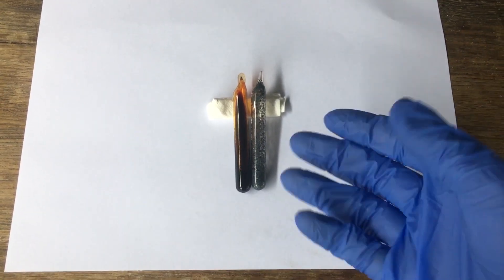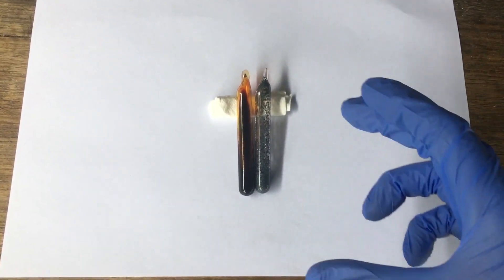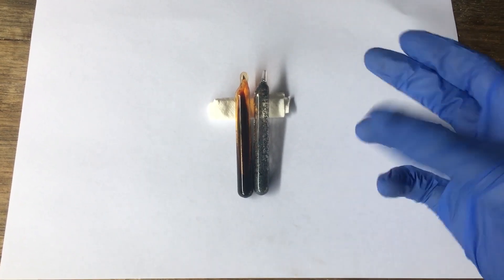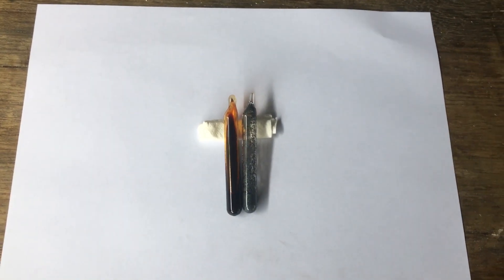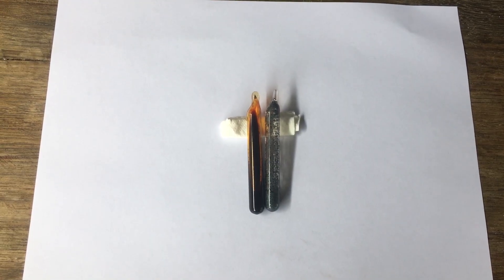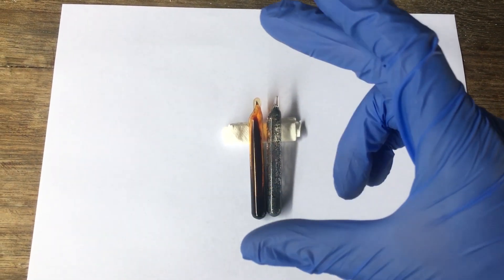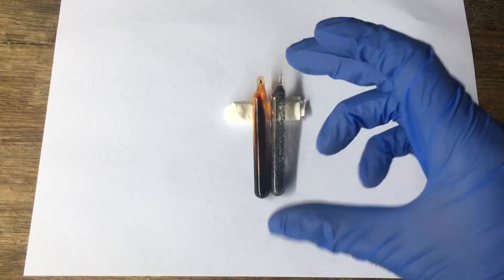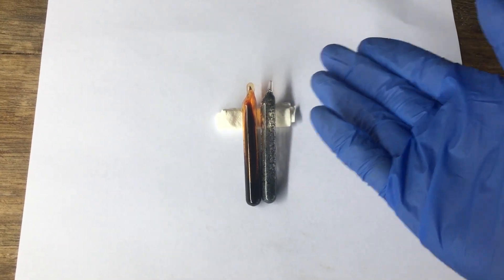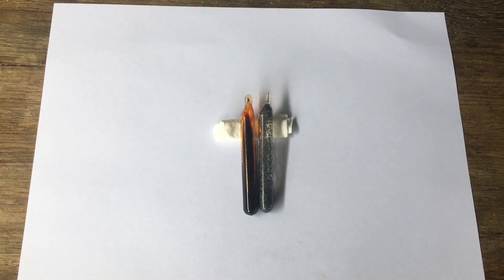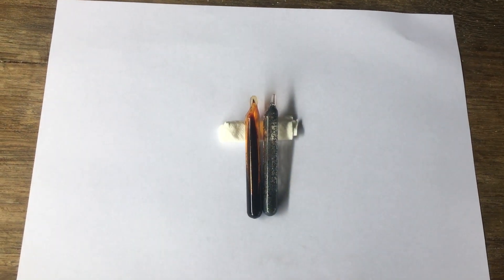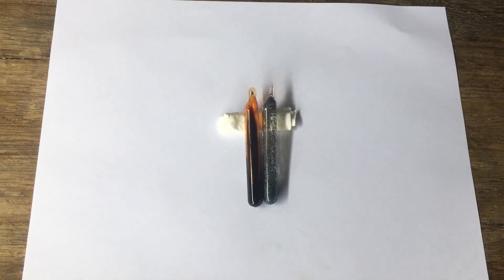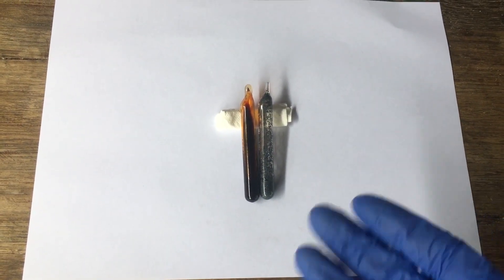Actually I'm not sure what would scare me more, making fluorine or having an ampule full of astatine. They both sound pretty horrific. But either way, that pretty much leaves us with just chlorine that we want in order to finish off our collection of the obtainable halogens. I think they'll all go nicely together as our nice little set of three ampules with the three easy halogens.